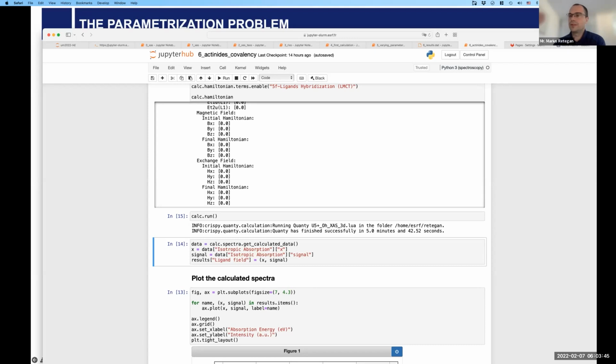When you say import, are you using the file format that Athena used to export, like an Athena project? No, the projects are not compatible. It imports in a similar way as Athena does from ASCII files, so you can set up which file you have. Which is the one you developed now for MCR-ALS? No, it's called FastOsh. I would just type it in. Okay.